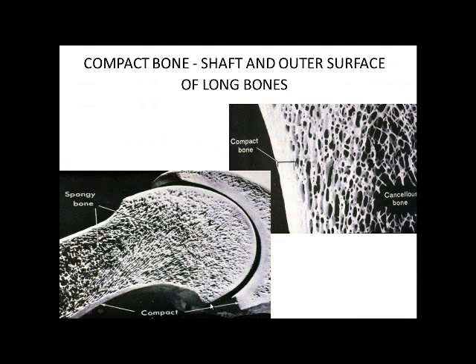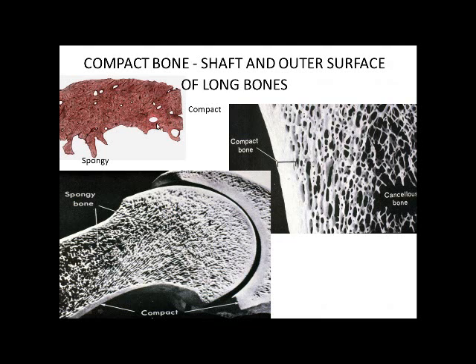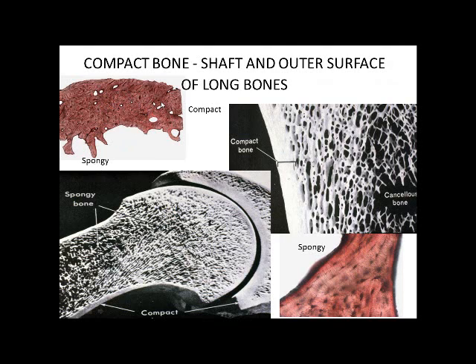Compact bone forms the shaft or the outer surface of bones. On the outside is compact bone, and on the inside is called spongy bone, or cancellous bone, where the bone marrow would be. The specimen we're looking at today is mostly compact bone, with a little bit of spongy bone on the inside.